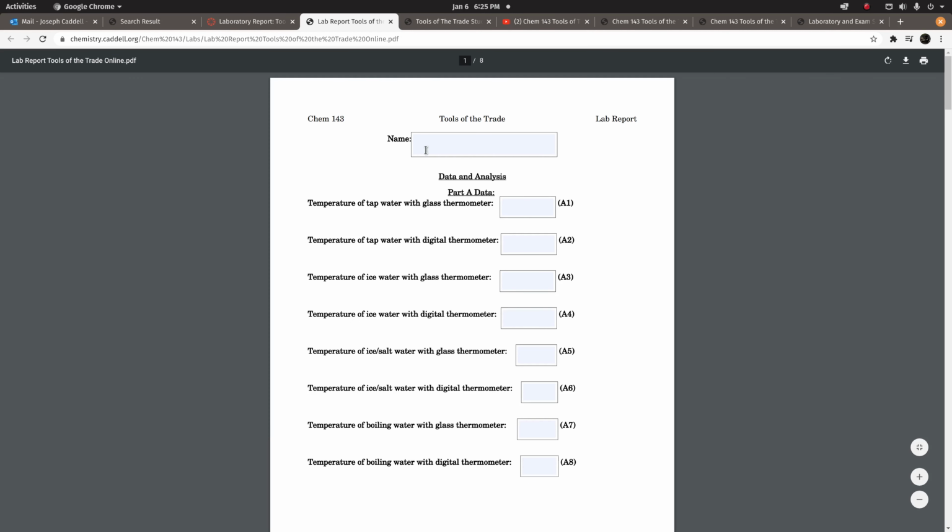But when you click on this, there are forms. This is a fillable PDF. So you fill it out. I would put my name. You would put your name. Don't put my name. And then your A1 that you read from that picture, you would put here. Say, I don't know, I forgot. I'm just going to put 12.2.